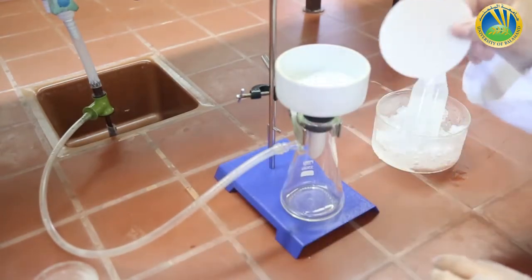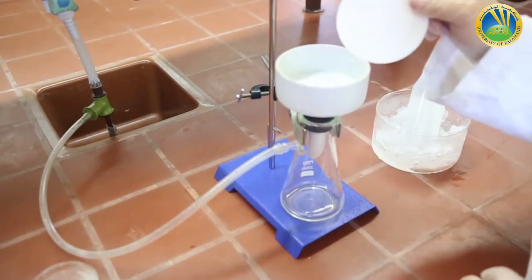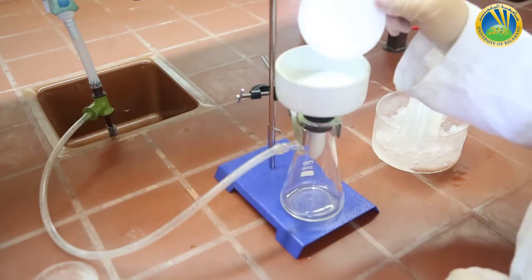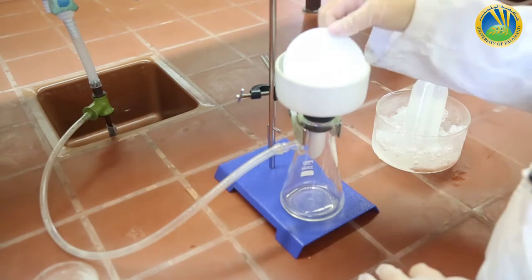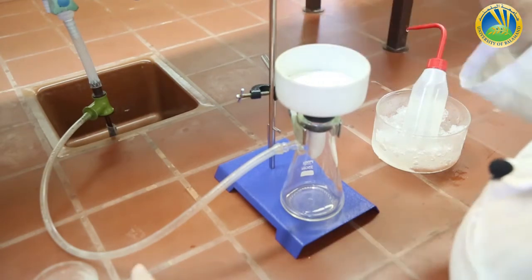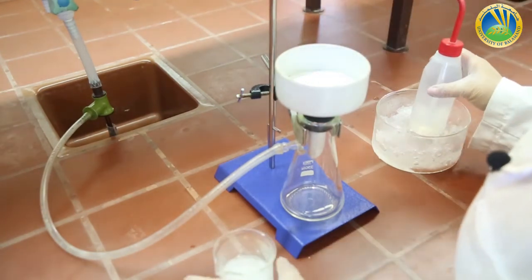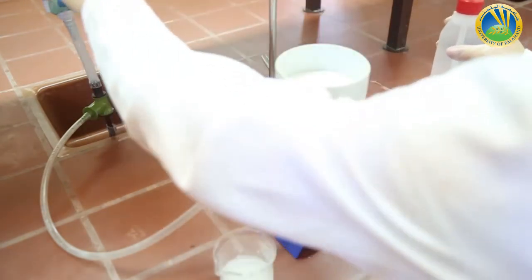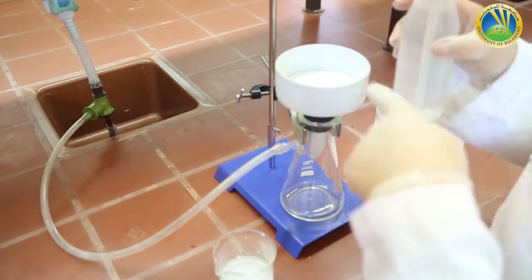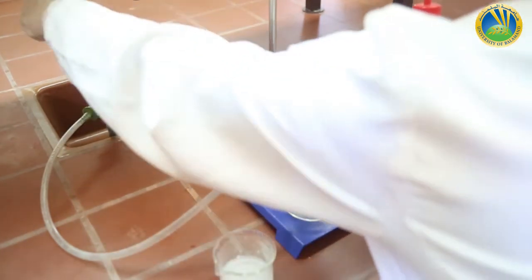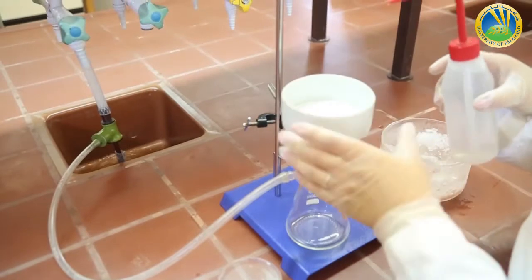Then I have to put a filter paper that I have weighed before, having the weight of 0.538 grams. I have to let it stick with a little bit of my solvent which is cold water. But first I have to turn the water on to have the vacuum inside.